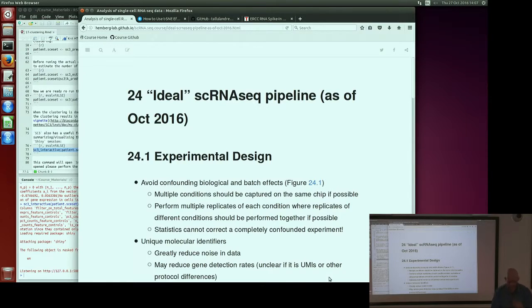Then we are going to let you work more independently. So what we just wanted to do is a little bit of a summary here towards the end about what we've been trying to tell you, which is how to set up a processing pipeline for analyzing single-cell RNA-seq data. We've tried to cover various different ways of how you can do things.